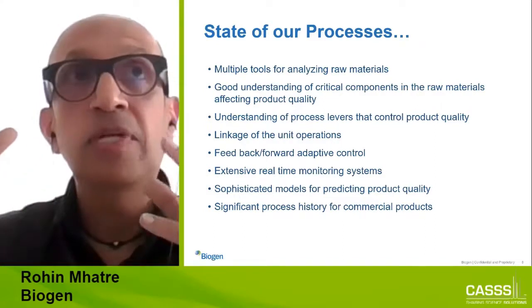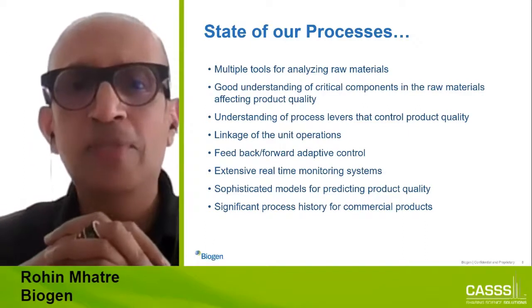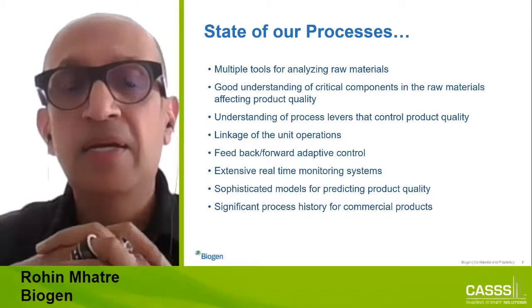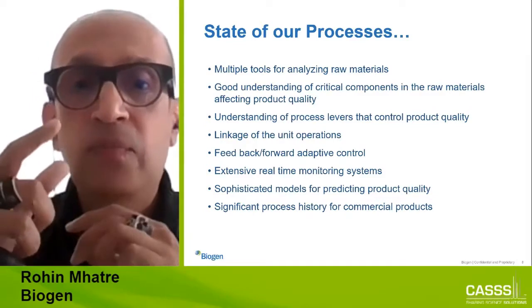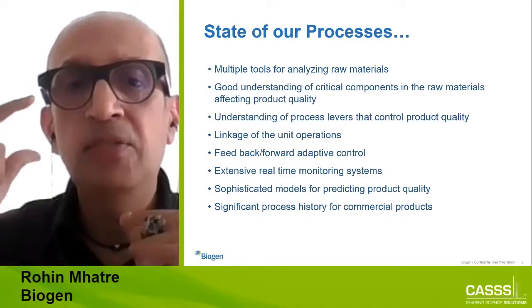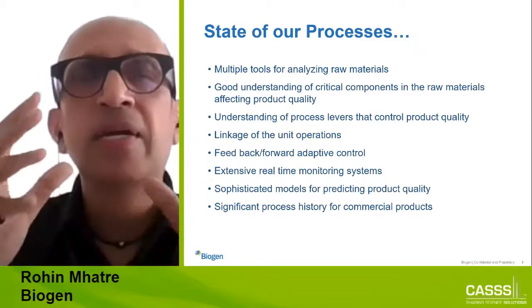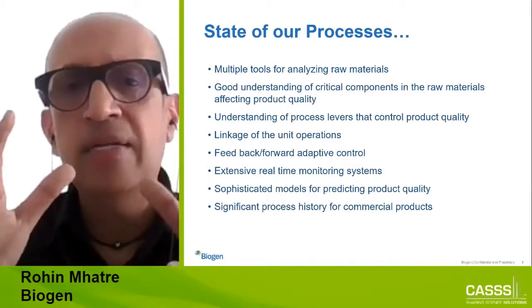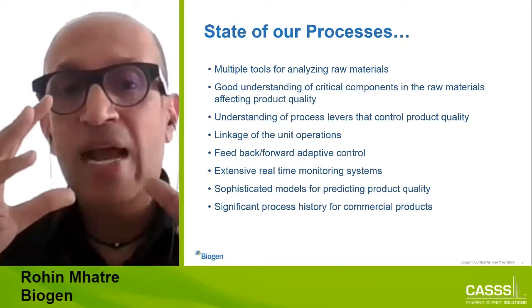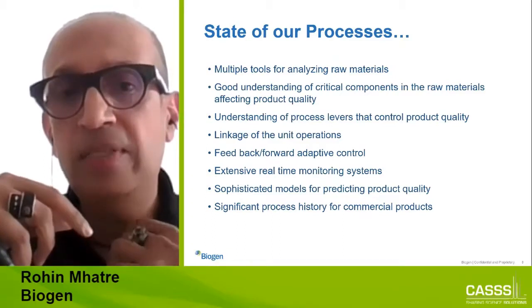The linkage of unit operations, we started on with QBD, which was the term used many years ago, and a lot of the linkages came from that. But an area where we had talked about, I would say 7-8 years ago, was our desire to do feedback and feed forward adaptive control. This was real time, done in as automated a manner as we could. And this is really the platform that we're evolving for many of our biologics. And I'll chat about that in a minute too.